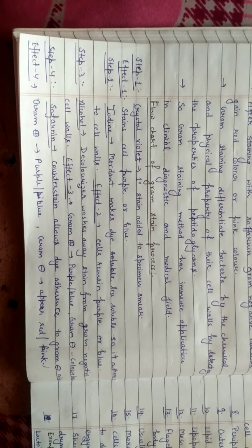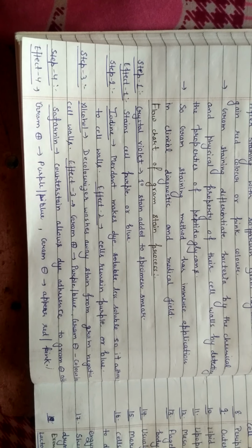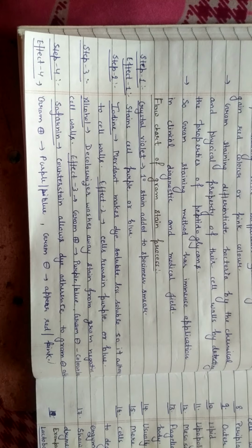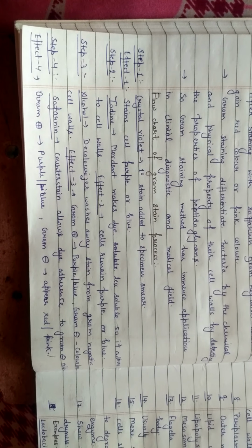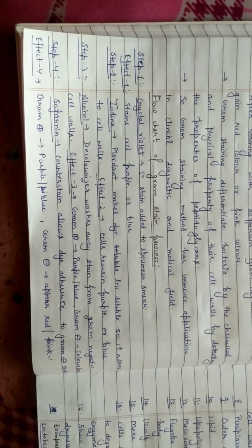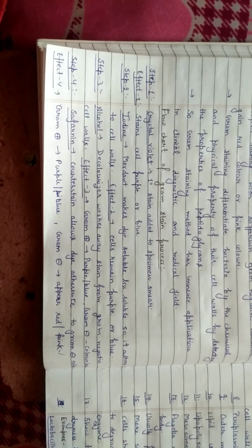Hello everyone, welcome again. Today in this video, I am going to share a new topic related to gram-positive and gram-negative bacterial staining. Gram staining is a process that was developed by Christian Gram, a Danish physician, in 1884. He developed this technique to distinguish between gram-positive and gram-negative bacteria species.